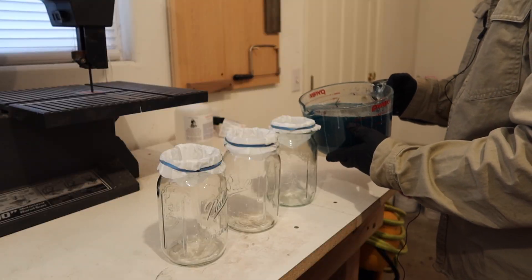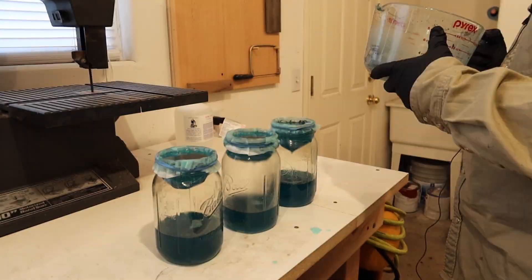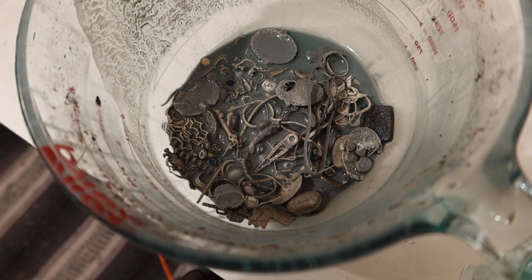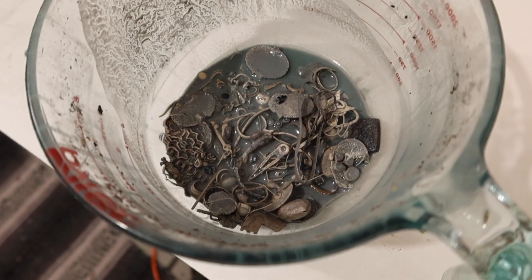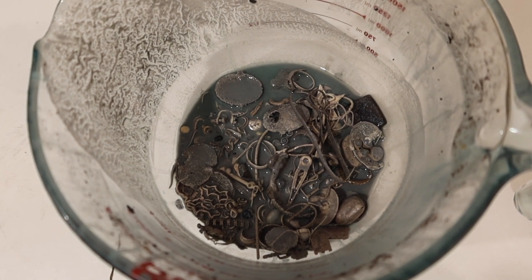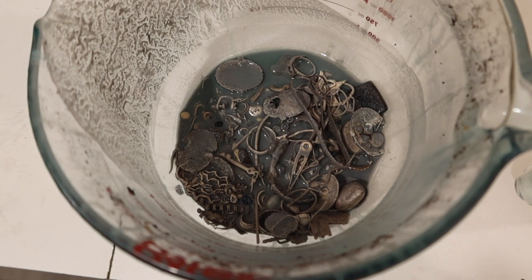Now I'm going to pour the silver and copper nitrate solution through filter paper into separate containers. I'm also going to wash the leftover contents of my container with distilled water. At the bottom of our glass we have the leftover silver gemstones and any gold pieces that were in the mix. Also I believe that gray stuff is silver chloride, which means my reaction must have been contaminated with some chlorine — even small amounts of chlorine will cause this to happen. I'll have to deal with that later.